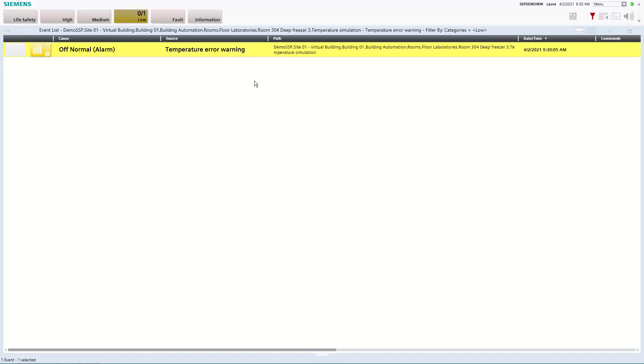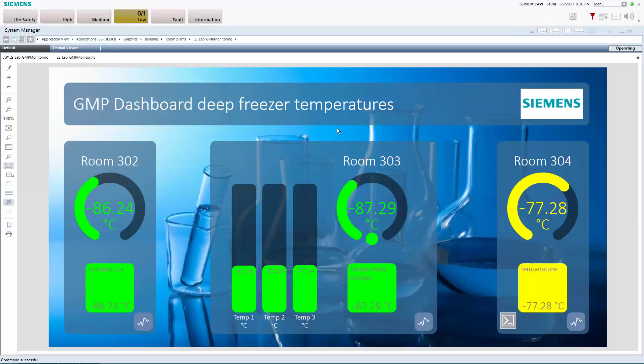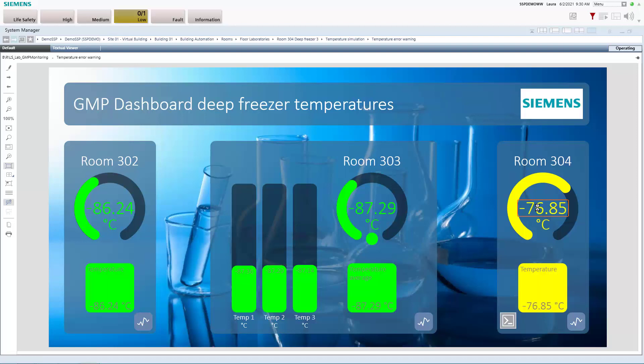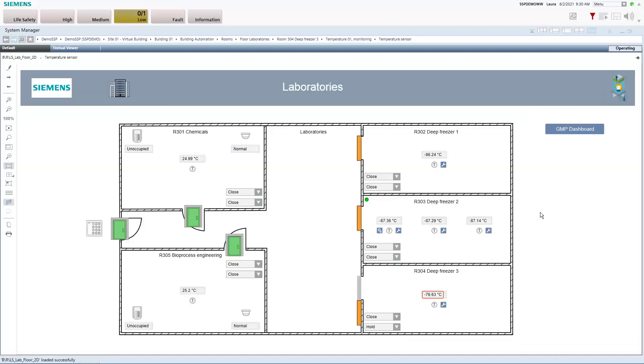So the next thing that we should now do is we should navigate to the graphic page of that deep freezer to see what's going on. And looking at this we already see that for some reasons the door here is held open. We don't know why we just see that it's not closing anymore and we are also not able to close it from here.